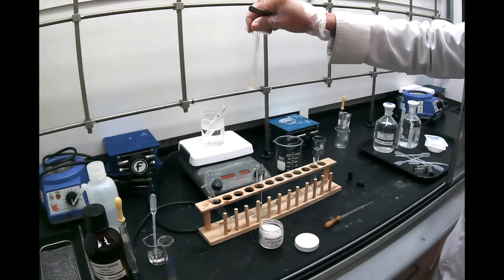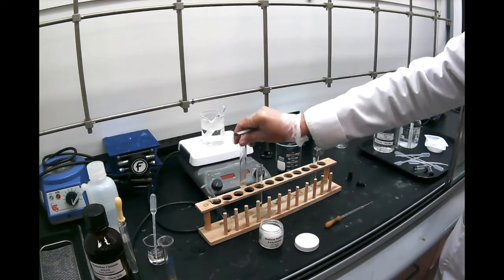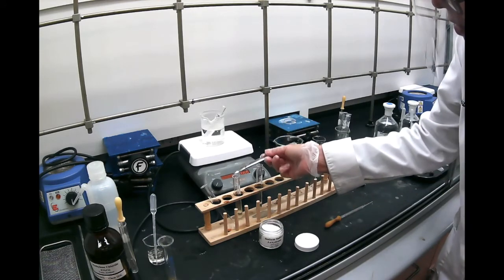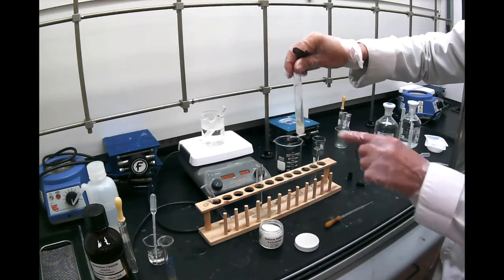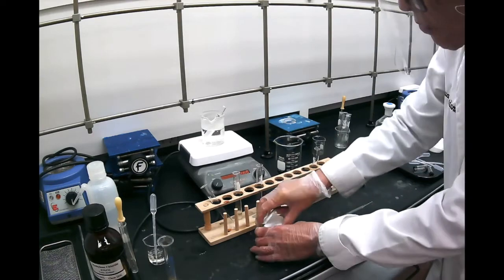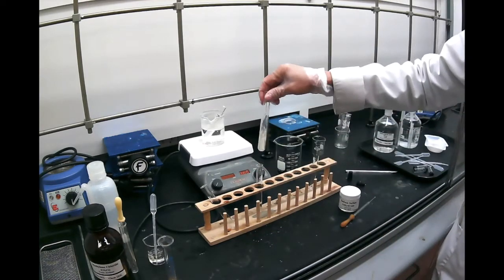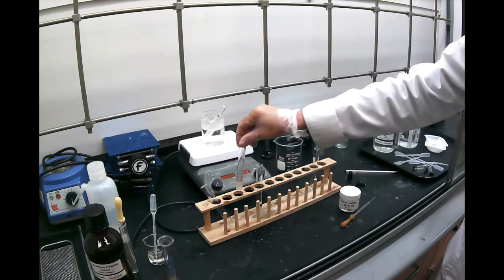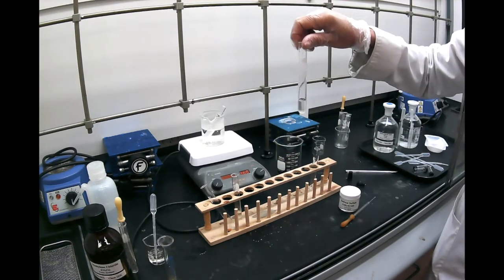and then stir it like we did earlier, and let it sit for a few minutes to remove all that water that is in the methylene chloride, in case you have any. So after you shake it, you let it sit like we said. And then in the meantime, let's look at this aqueous layer.